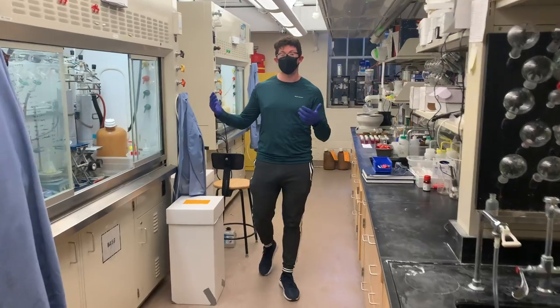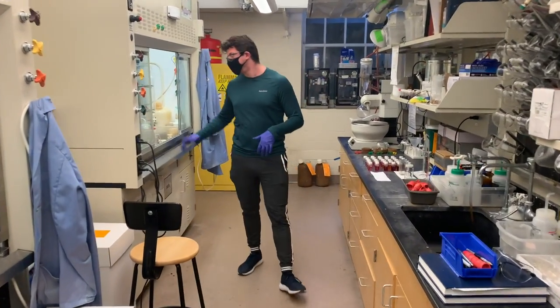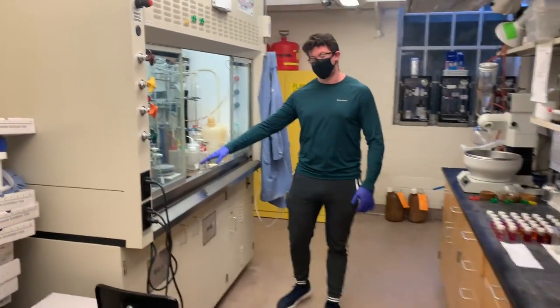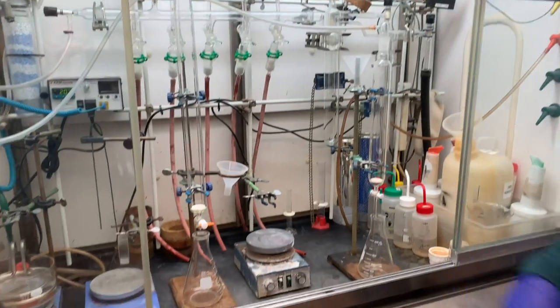Here in the Rosenthal Group we have 8 total hoods, 4 rotavaps, and 2 ovens for drying off our glassware. In each hood we have 2-3 stir plates, as well as a Schlenk line for our occasional air-free techniques that we need to utilize.